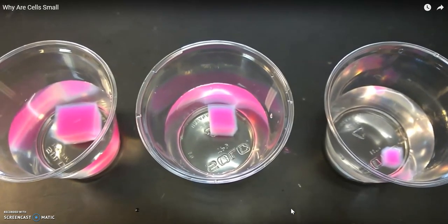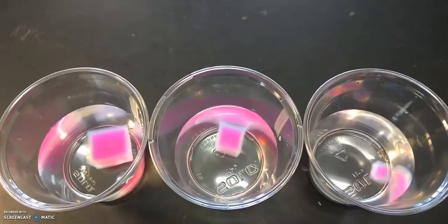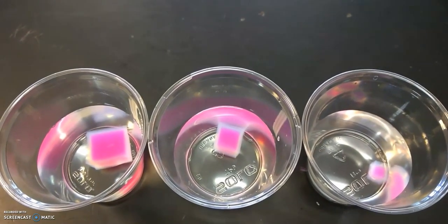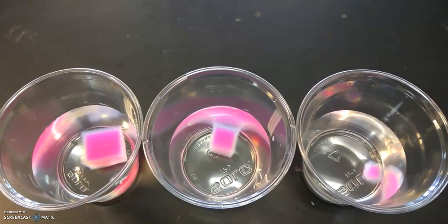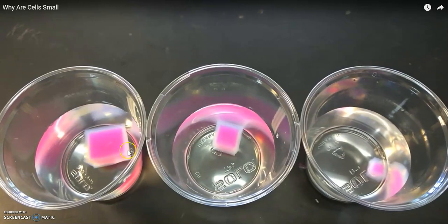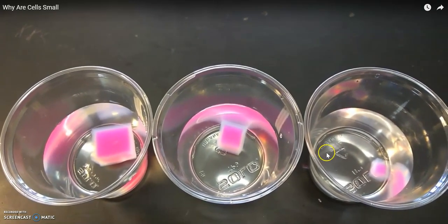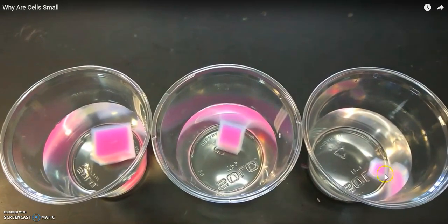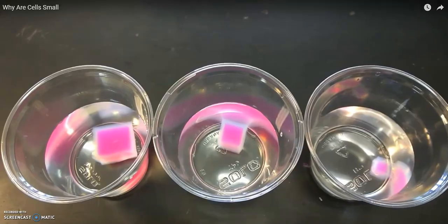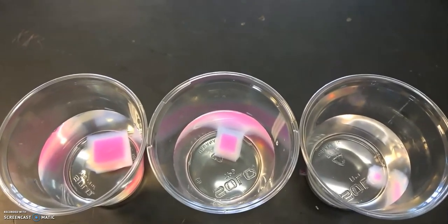You can see the bleach starting to do its job and removing the color from the beetroot. This is what my cubes look like two minutes after I put them in bleach — that color is still being removed. We can see some edges starting to form. If we compare our large cube to our small cube, we can see that a lot more of our small cube looks white compared to the large cube.